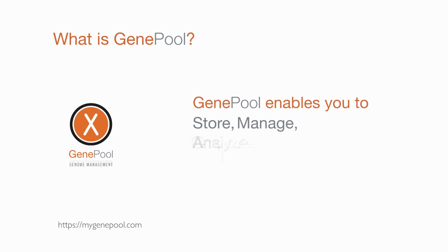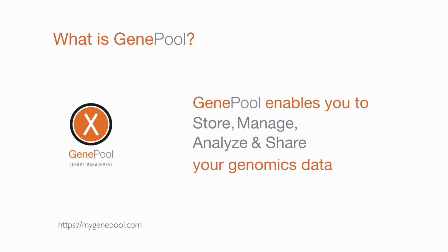In summary, GenePool makes it easy for you to store, manage, analyze, and share your genomics data.